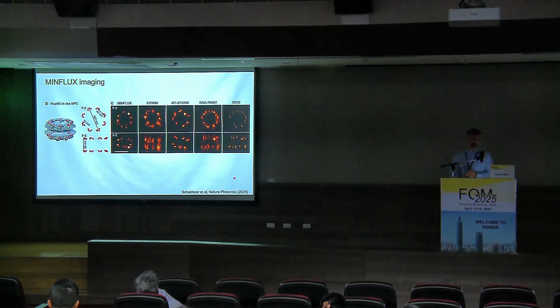So here you have a comparison of published data using different super resolution techniques, MINFLUX, but also single molecule localization microscopy techniques. And they were all obtained on the same sample, the Nup96 reference standard. If you compare them, especially the Z resolution, you see that MINFLUX really does very well, but it does not do better than, let's say, 4Pi super resolution microscopy or this new approach, RESI, which is an extension of DNA-PAINT that clusters together many localizations in DNA-PAINT.